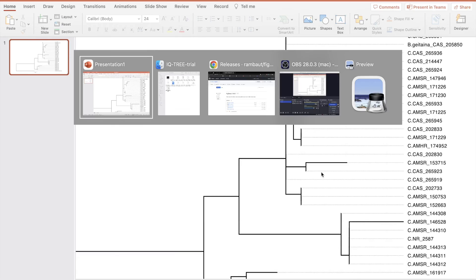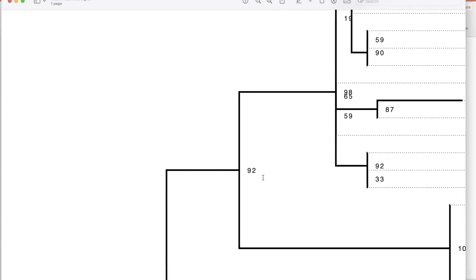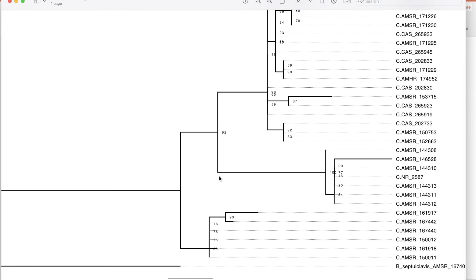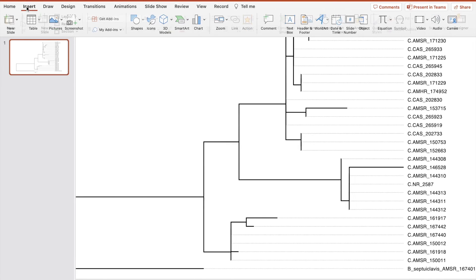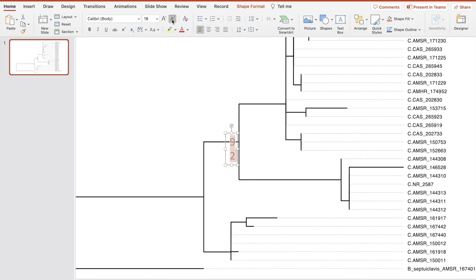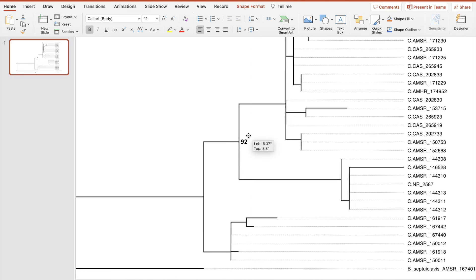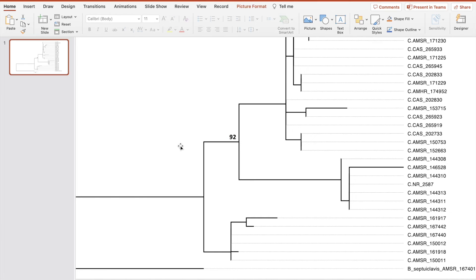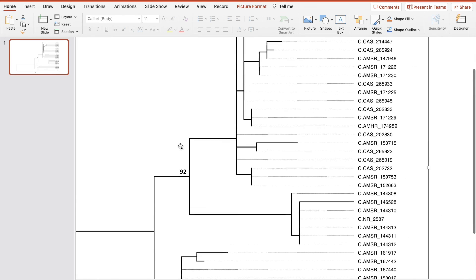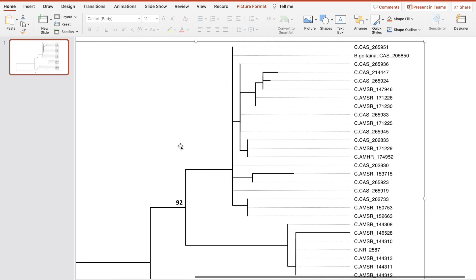Let's close this and open the one with the bootstrap values. For example, 92 will go right here. Now I have the flexibility to put this number — 92 — anywhere I want. I can put it down, to the right side, to the left side, above or below. I can change the font size very easily. That's why I like to use PowerPoint for this. You can keep doing this until you're satisfied with the results.